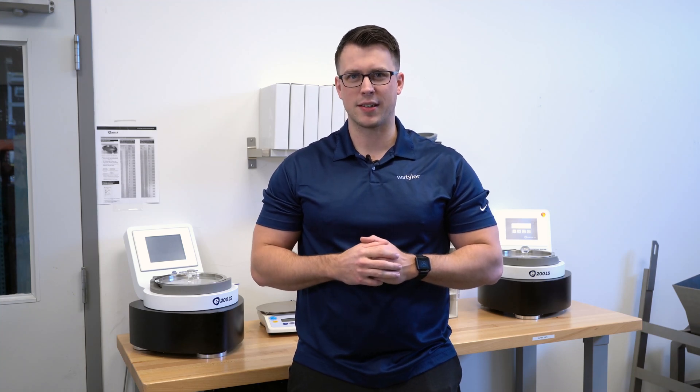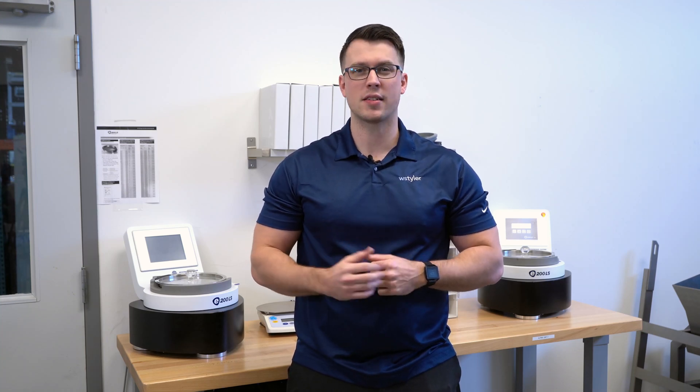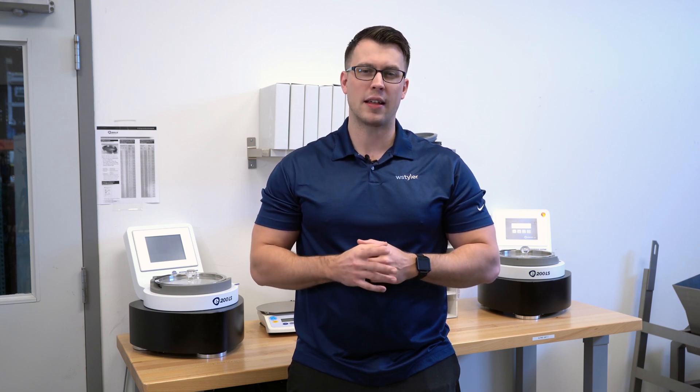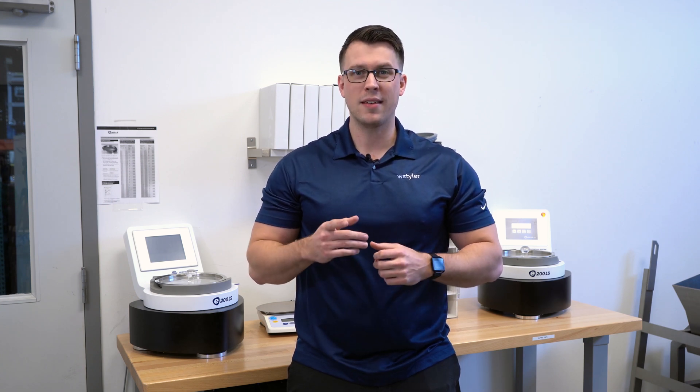Are you interested in improving your particle analysis? In this video we're going to explore the basics of the E200LS Alpine Airjet sieve and determine whether or not the device is right for you. Let's get started.